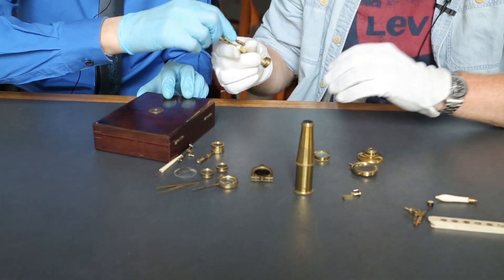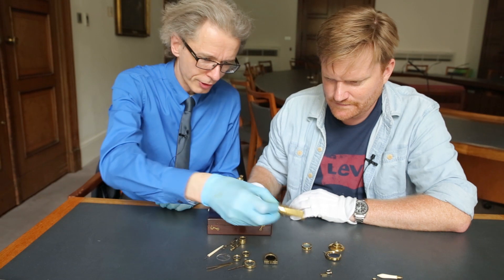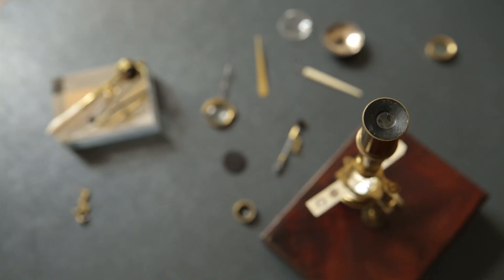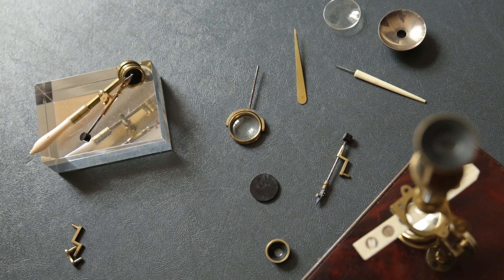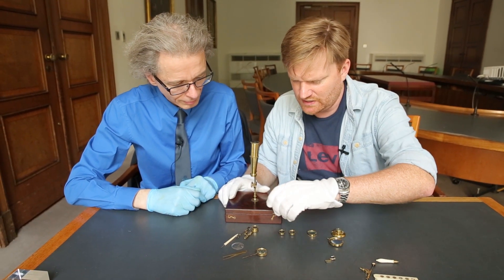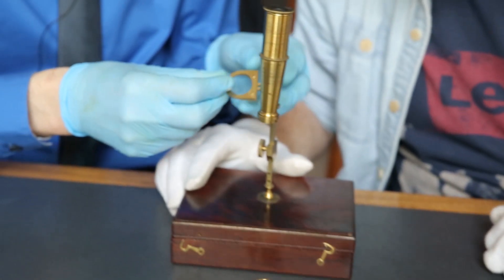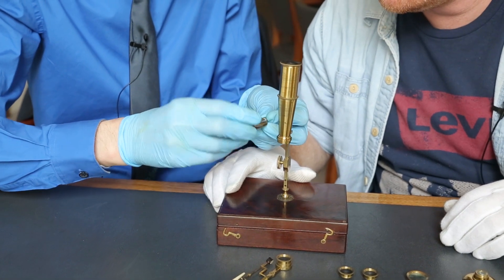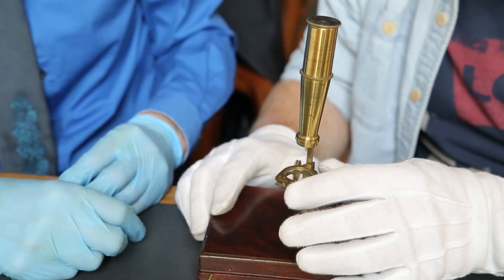Do you know how to start? Well it's kind of obvious because the box is actually the base of the microscope. So you can see straight away that what happens is you just screw your microscope onto the box. So this is the business end — so now you've kind of almost got a microscope. A lot of the lenses are just different magnifications, so you can swap them on the barrel of the microscope depending upon what you're looking at. I'm guessing this is the platform — the main observation? Yeah, it's a stage. What you've got here is a stage where you can either slide your microscope slides, or if you're viewing something which is in water, you can just place your glass on top with a drop of water in it, and view that under the microscope.